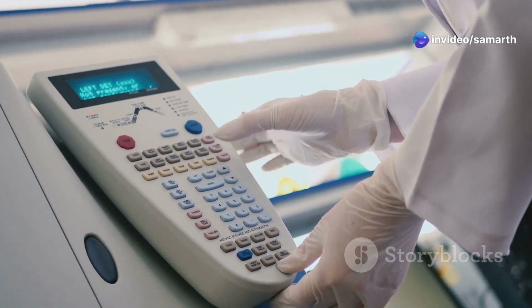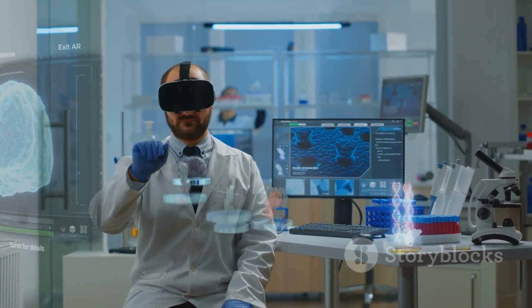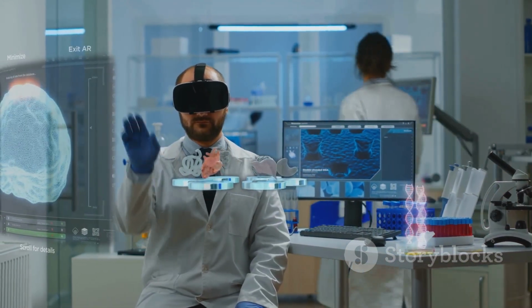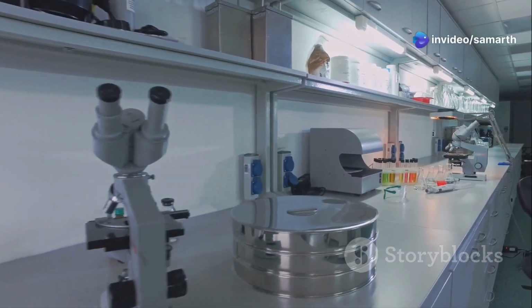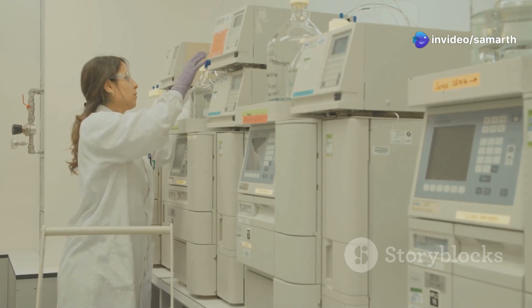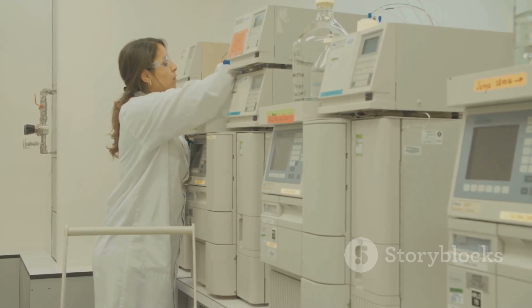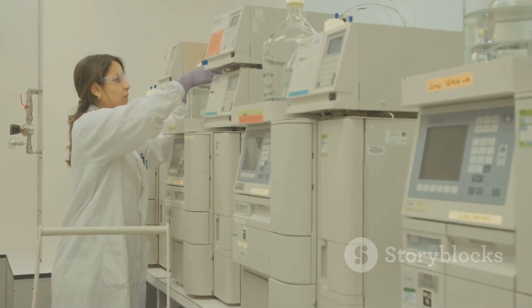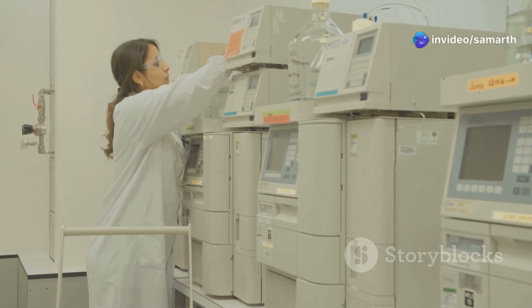FTIR spectroscopy has become an indispensable tool in countless fields due to its ability to provide detailed information about the molecular composition of materials. Let's explore some of its remarkable applications. 1. In the pharmaceutical industry, FTIR spectroscopy is widely used in drug development and quality control. It helps identify and quantify pharmaceutical ingredients, ensuring the purity and consistency of medications.